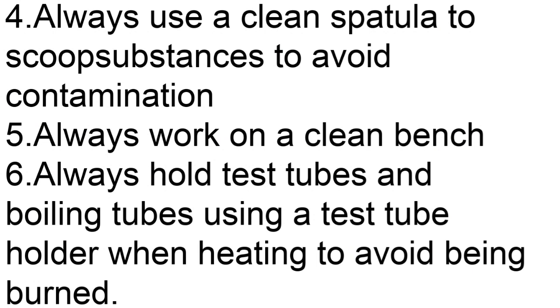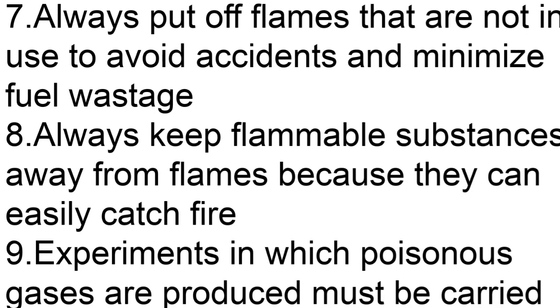Always work on a clean bench. Always hold test tubes and boiling tubes using a test tube holder when heating to avoid being burned. Always put off flames that are not in use to avoid accidents and minimize fuel wastage. Always keep flammable substances away from flames because they can easily catch fire.